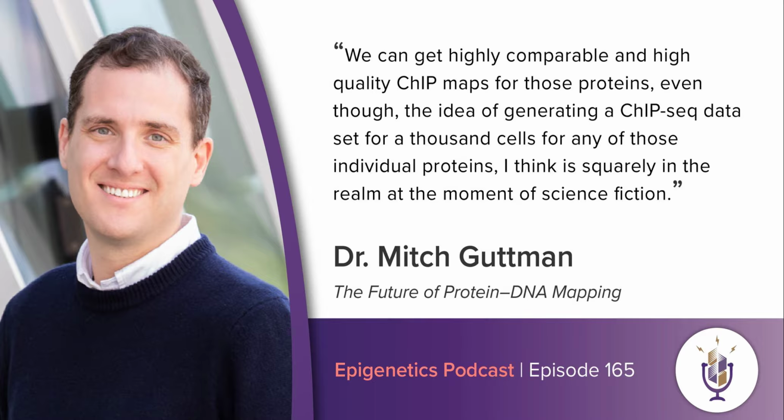Exactly. One way that I often think about this split pool process that may be helpful is, imagine that we were able to do this same experiment where we put a single bead with a single antibody type, and we were then able to come up with some really clever microfluidic device that can isolate that individual bead and that individual chromatin, and we can just uniquely tag that isolated bead.